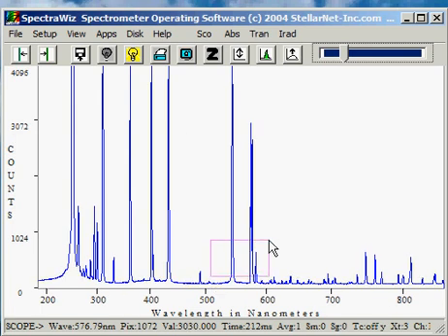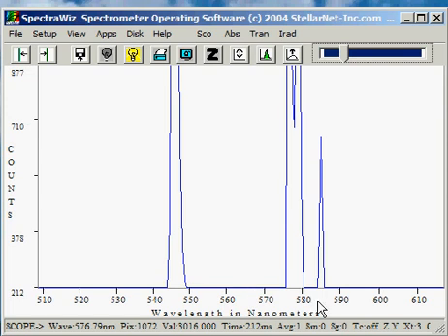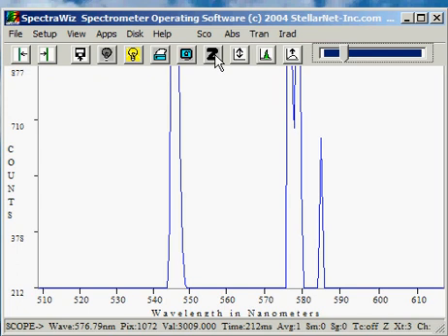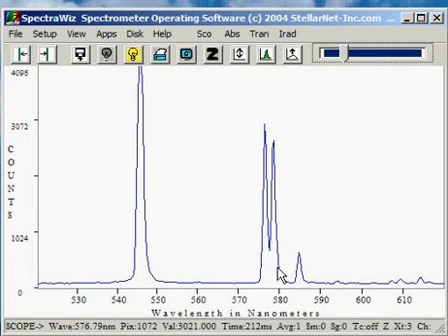I can quickly go back to the area that I was located in by making a selection again, but I'm clipped at the top and clipped at the bottom. That's because I have YZoom enabled, which is indicated in the status line below. If I left-click again on the Z button to disable it, I can then unzoom and then rezoom without a Y effect.